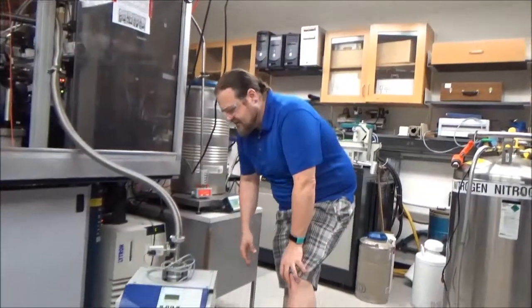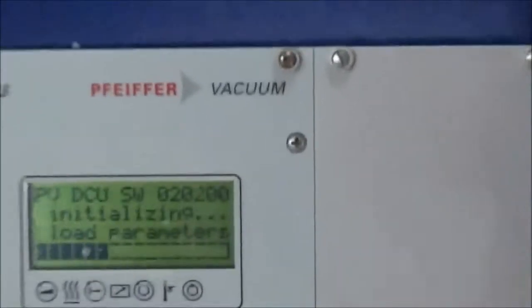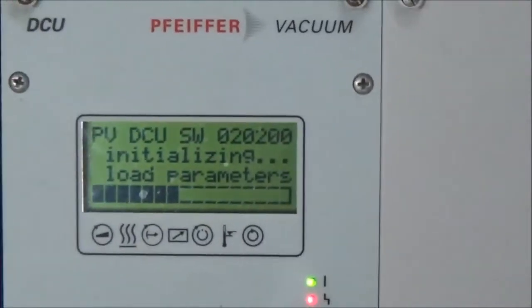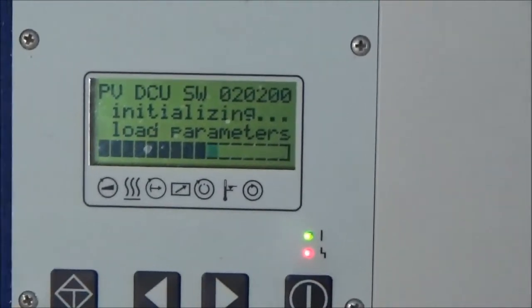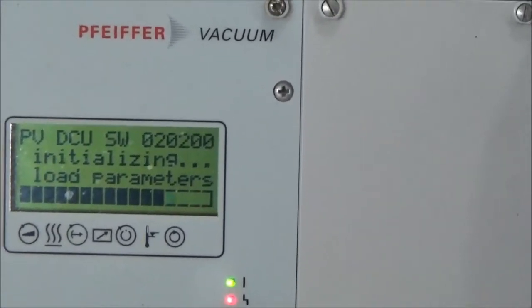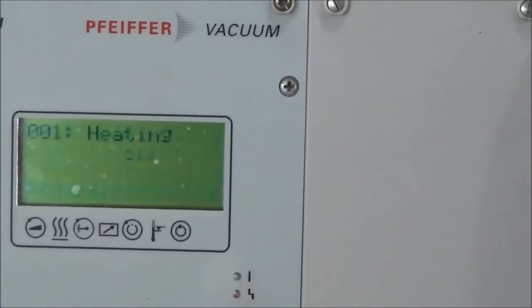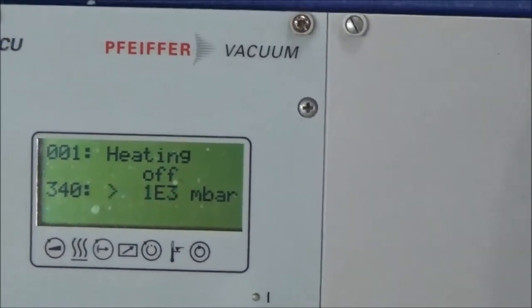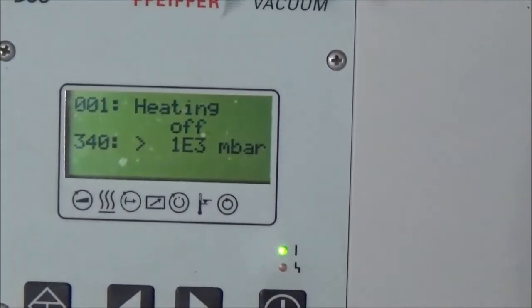Okay, the next part of this, we're going to turn on the vacuum. So we flip this, everything's all hooked up, and we flip this thing on. And Andrew, why don't you come in here and get a picture of the screen. So we'll, I'll probably speed this up. Okay, see, we got a pretty high, pretty high pressure here. And we are now going to start up the vacuum.